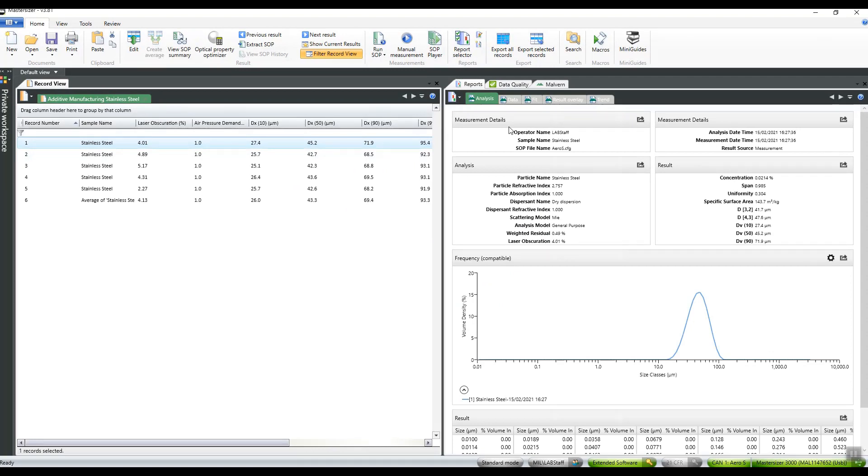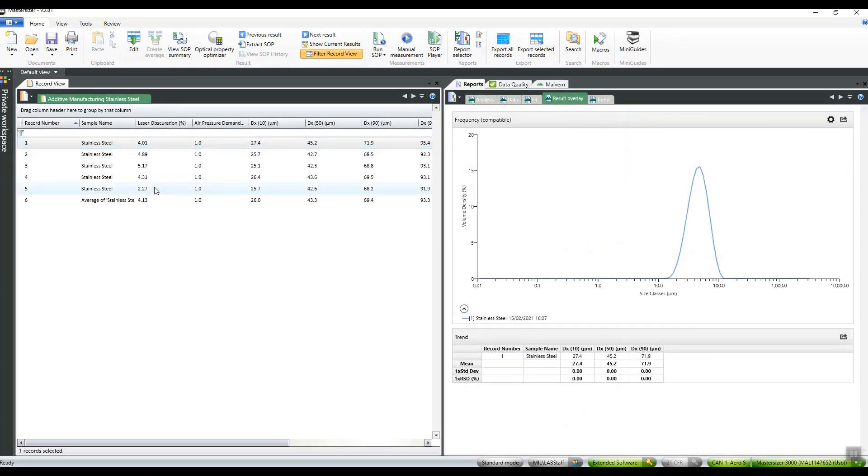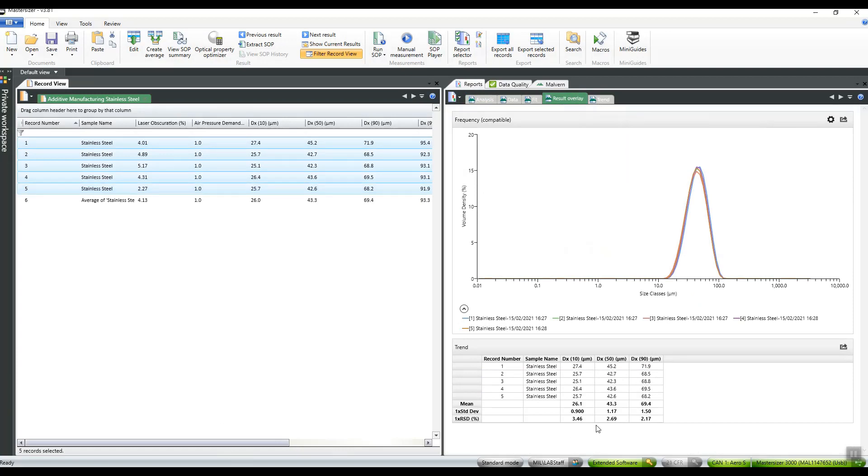Size results can be viewed in different reports, including as overlays and trend graphs, both of which show the variance of measurements by the relative standard deviation percentage values.